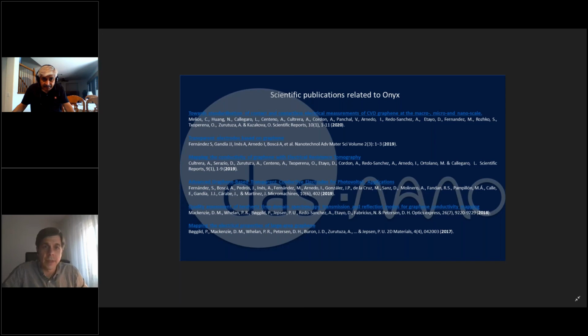This is a very tough question. It will depend on the actual configuration, depend on the thickness and other parameters that you want to explore. If you're usually doing the same experiment, then not a lot of information is required, so known information actually. But if you are modifying your thickness and your number of layers and these kind of things, then yes, we would need this kind of information, like thickness and the range of the dopants that you're using. Okay, thank you.